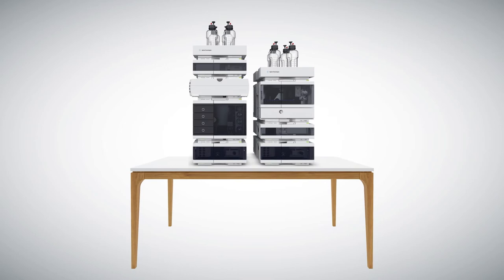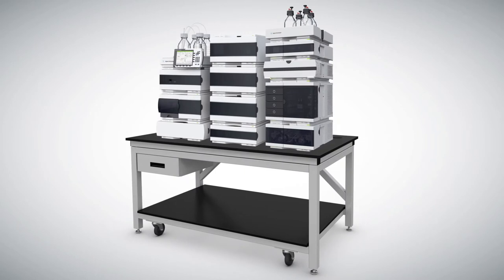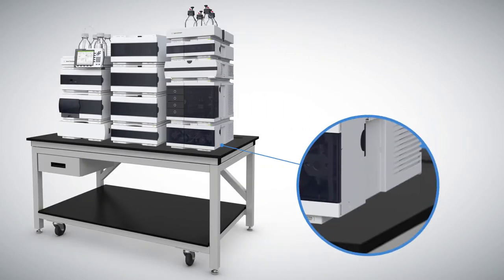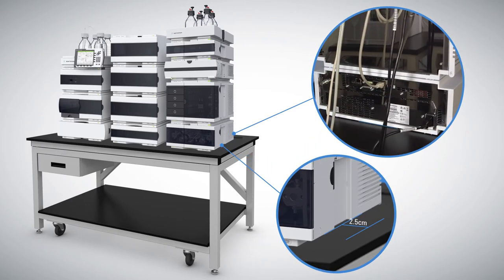Your new LC can be placed on almost any desk or lab bench. There are a few things you will need to consider before selecting the perfect location for your new instrument. Most modules require a minimum of 2.5 centimeters on either side of the LC and about 8 centimeters in the rear for air circulation and electrical connections.